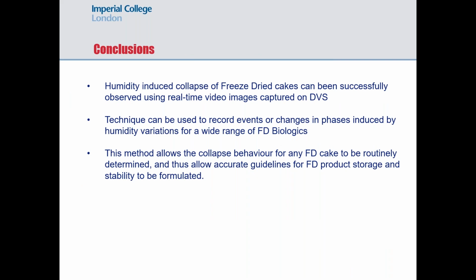So conclusions here are that humidity-induced collapse of freeze-dried cakes can be successfully observed in real-time images using the DVS. We can record eventual changes in phases induced by humidity variations for quite a wide range of freeze-dried biologics. And we can look at the collapse behavior of any cake routinely and determine some fairly accurate guidelines for the storage and stability of that particular formulation.